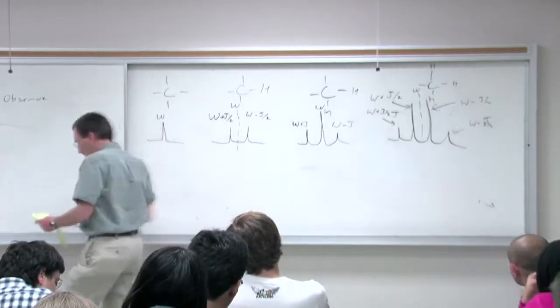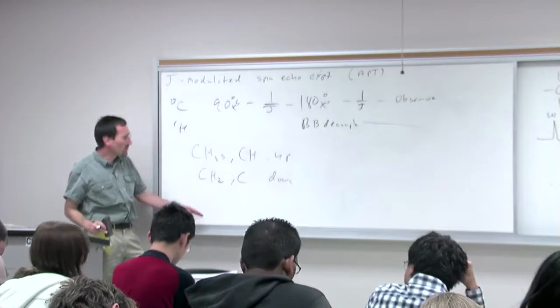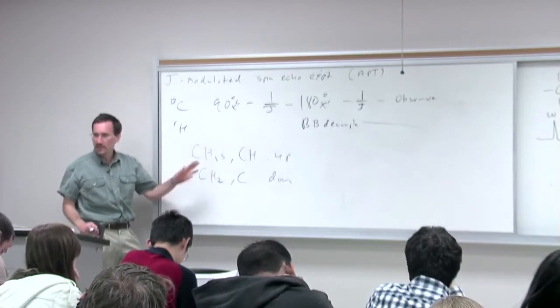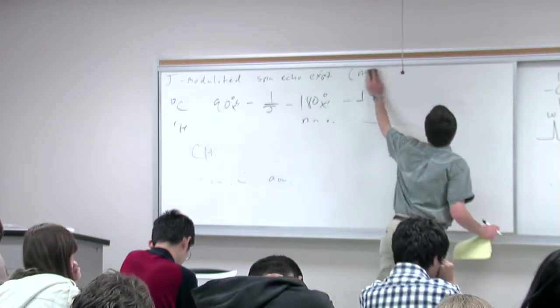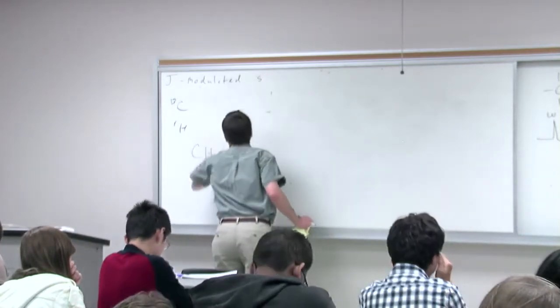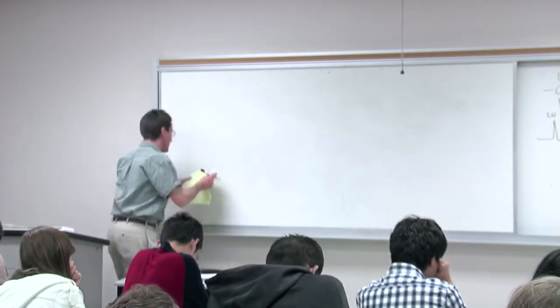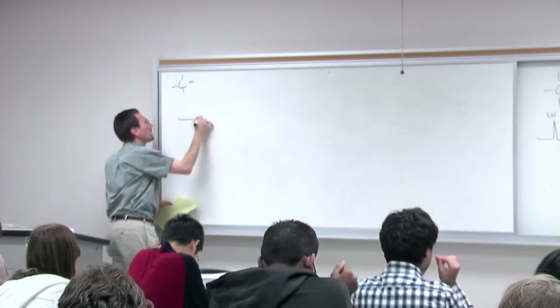All right, that sets us up now to start to consider the different scenarios. And we'll just consider the quat, the methine, the methylene, and I think by the point you get to the methyl, it'll all sort of make sense. All right, so let's try this scenario for a quat carbon.